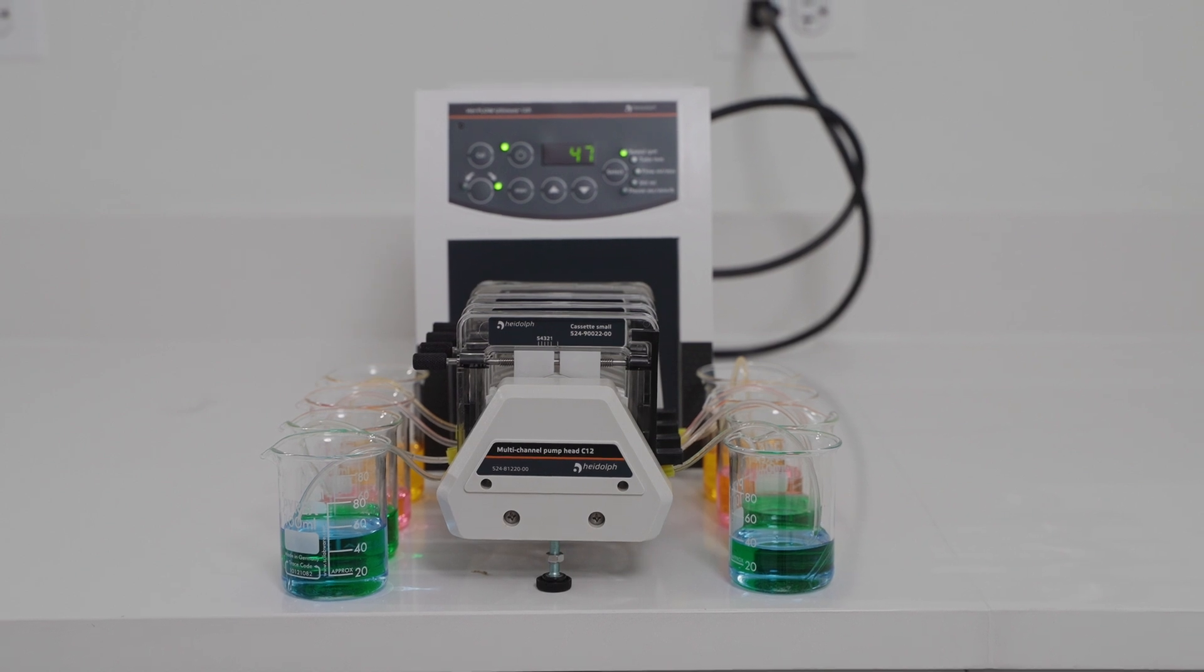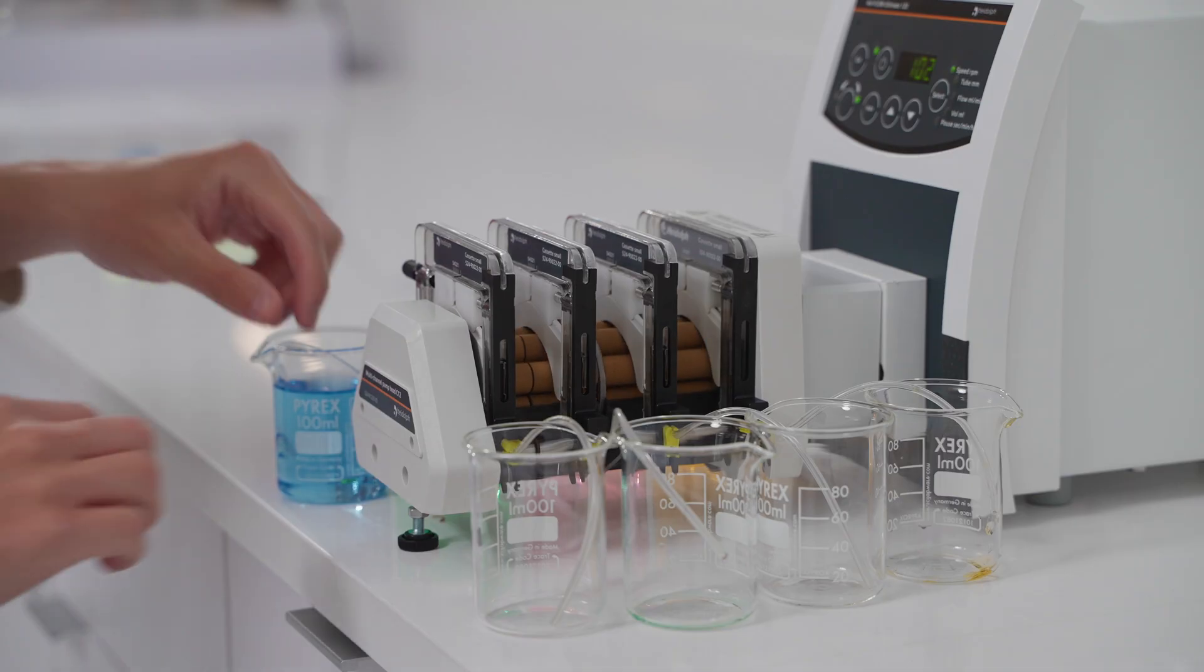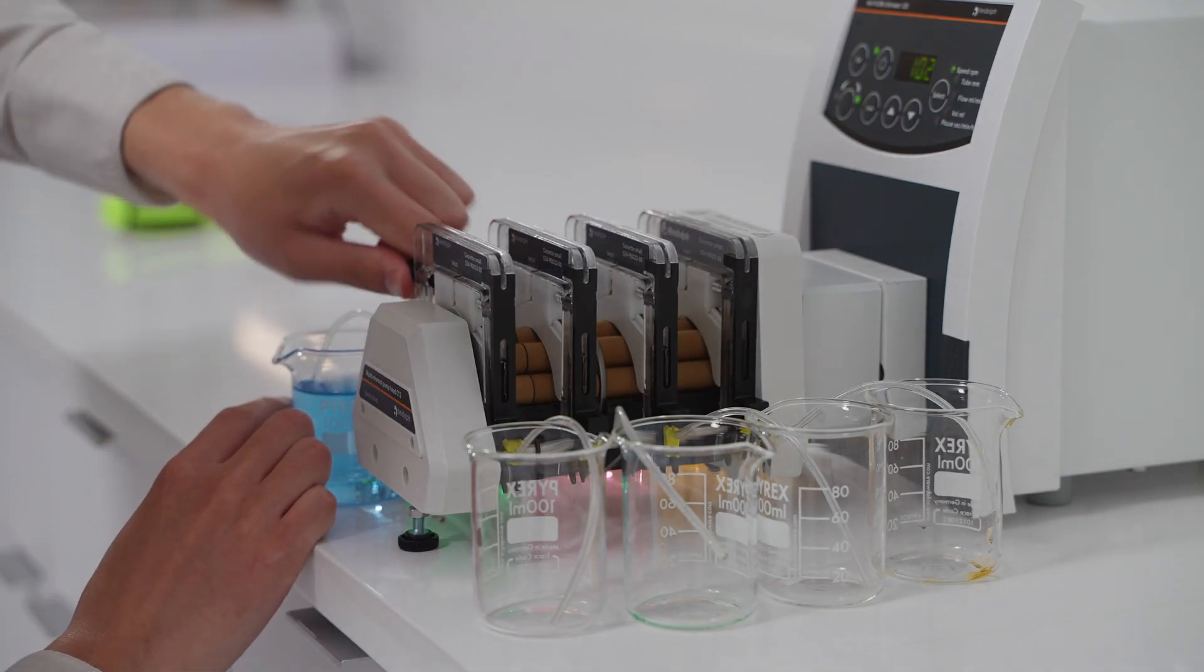Additionally, the C12 has two features that help it distribute the fluid evenly. The first feature is the built-in gear reduction system that allows the pump head to distribute the smallest amount of liquids accurately. The second feature is the eight roller system design that allows for low pulsation across all 12 samples.